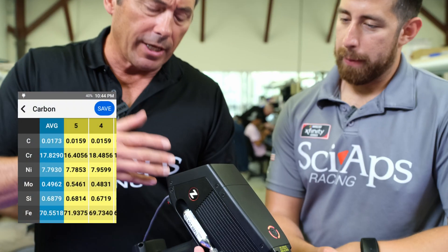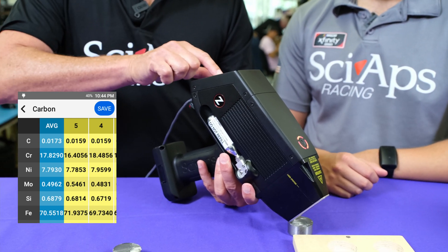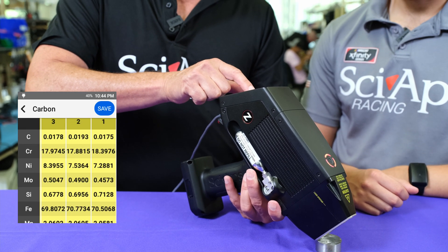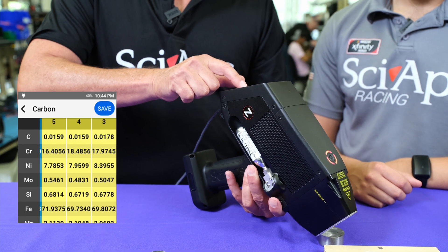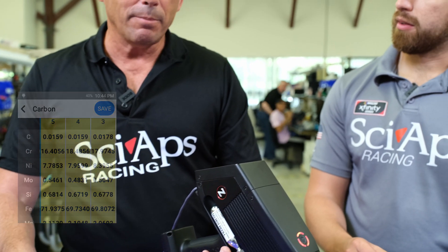The blue column is the average of several tests. If you scroll over here — that's the shot-to-shot repeatability. That's really good. Like 0.017, 0.019, 0.018, 0.016 — 0.016 again. That's within plus or minus 10 parts per million.